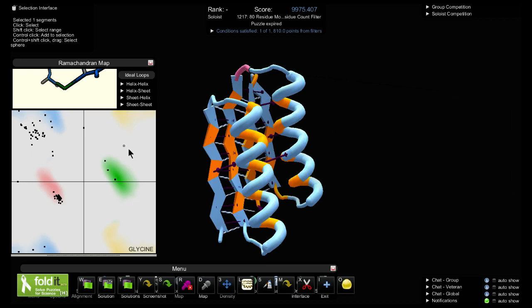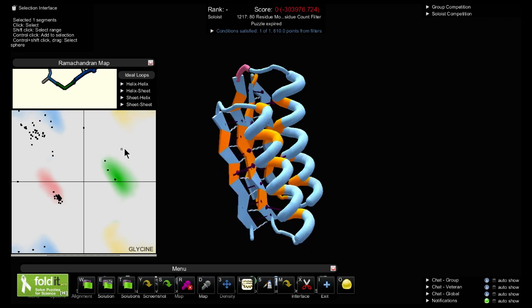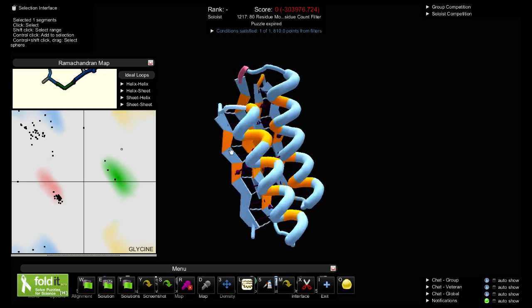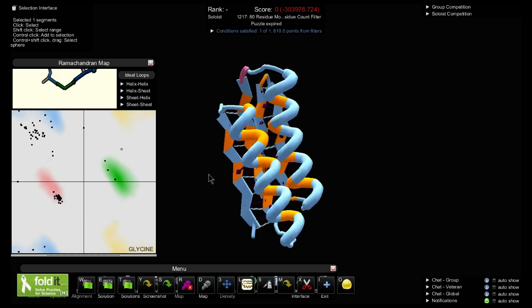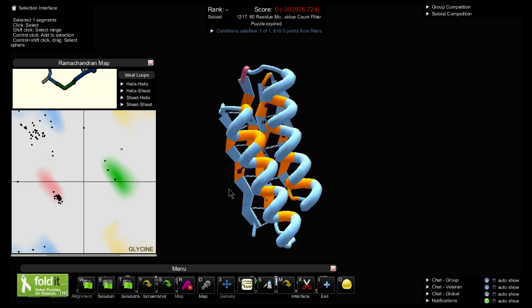This is the segment that has an unrealistic shape. To try and make it more realistic, I want to move that dot into a colored area. I'm not going to make a huge move by dragging it all the way down there at once — I'm just going to move it a little bit by clicking and dragging this dot a little bit towards the green, and then look and see what it does to my protein. It's taken half the protein — two sheets and a helix — and rotated them. Let me undo and redo that. You can see it's rotating half the protein, the half divided by this glycine from the other half, counterclockwise a little bit. So I want to fix that rotation.